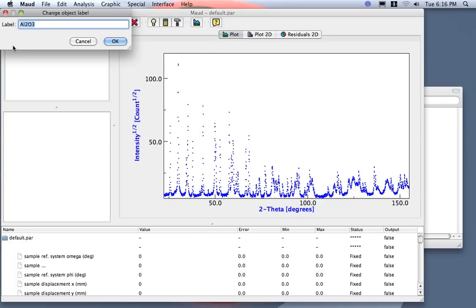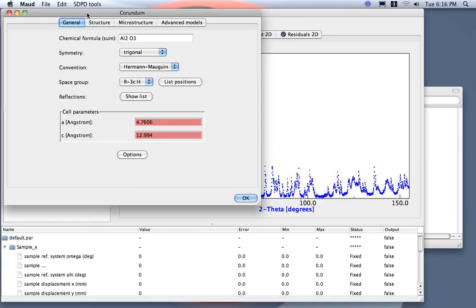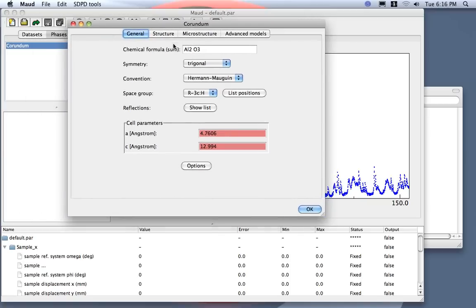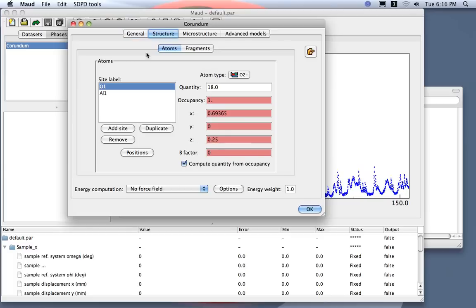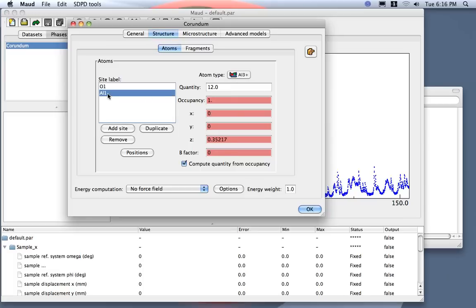I double click, and I change the name, as I prefer, corundum here. We can edit here, and see the characteristics, and just check if Maud was loading them correctly. So, chemical formula is this one, trigonal, space group was recognized, parameter. And structure here, we have the oxygen and aluminum. And check here, the atom type was recognized correctly.